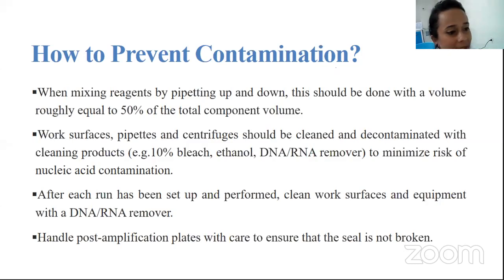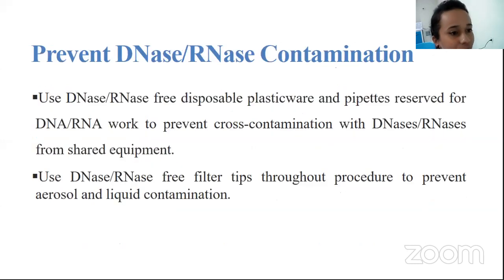After each run has been set up and performed, clean work surfaces and equipment with a DNA/RNA remover. Handle post-amplification plates with care to ensure that the seal is not broken, to prevent any cross-contamination. Use RNase- and DNase-free disposable plasticware, and pipettes reserved for RNA/DNA work, that is dedicated pipettes, to prevent cross-contamination with RNases and DNases from shared equipment. Use DNase/RNase-free filter tips throughout the procedure to prevent aerosol and liquid contamination.